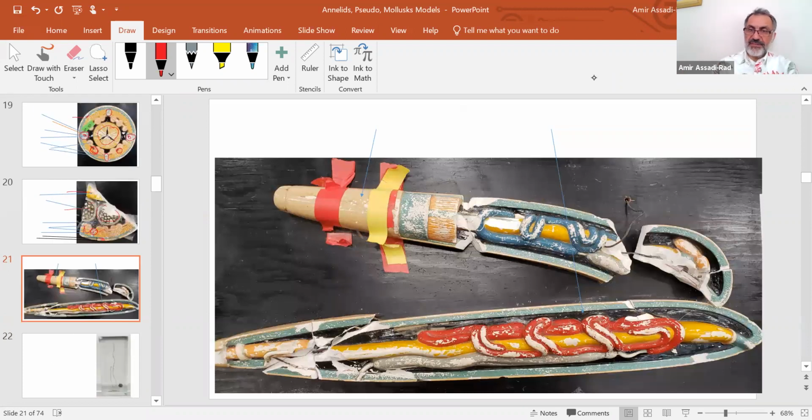Same thing again, high magnification, anus, intestine, the yellow, and the red, combination of the ovary and oviduct, uterus, all of the gray, vagina, and then the tip is the genital port. Okay, so the lighter area is hypodermis and cuticle right there. Longitudinal muscle, lateral line, hypodermis, cuticle. Male, of course, female.